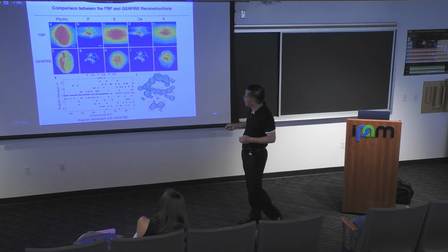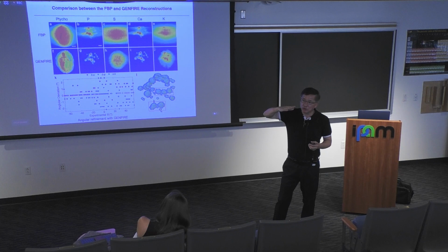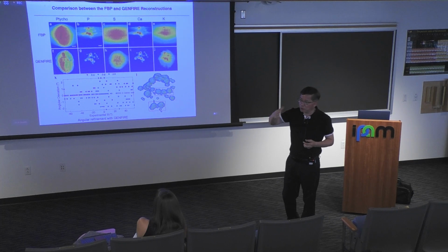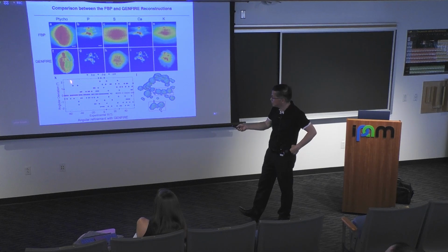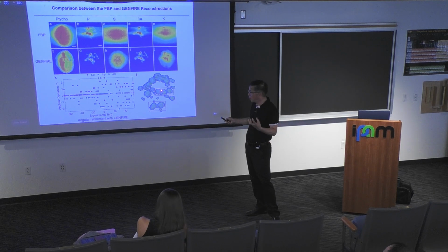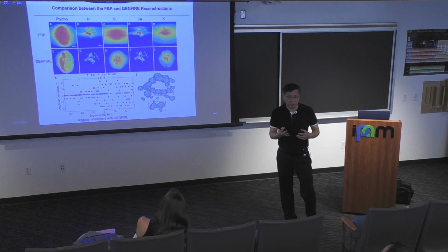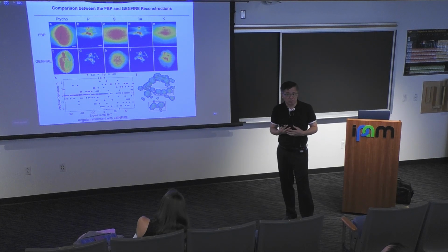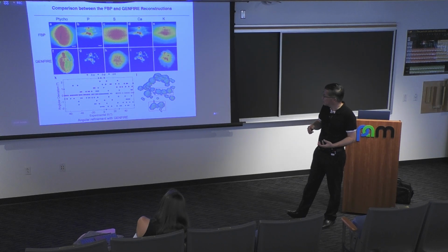You can see calcium, and our algorithm can also do automatic angular refinement, because when you do an experiment, the angle is not exactly accurate. There's instrumentation error, there's all kinds of error, right? But we can do automatic angular refinement. We find for each projection how much deviation of the angle there is, and you can see the green versus the blue. After refinement, the blob should be more spherical. So there's a lot of development. Of course, deep learning has a lot to learn to take care of all this. There's a lot of detailed stuff, not only signal-to-noise ratio, but missing data and angular refinement.